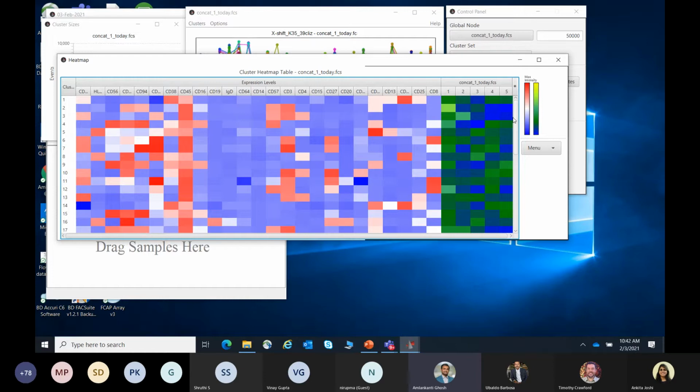So I think I am quite okay with what I planned to show today. One dimensionality reduction algorithm, which is t-SNE, one clustering algorithm, which is XShift, and the last one where you mix and match everything and do a lot of deep study, which is the Cluster Explorer. So maybe we can have the second round of questions for the quiz, and then Tim can take it away from there.